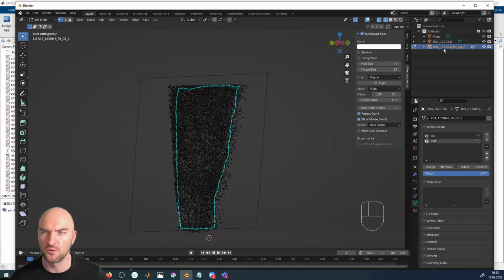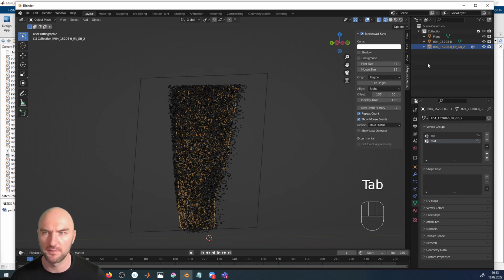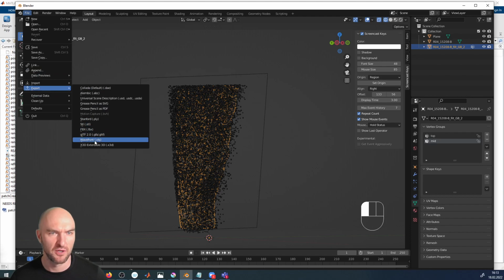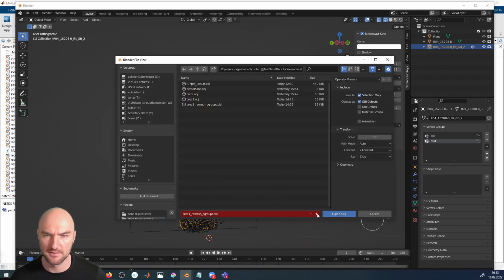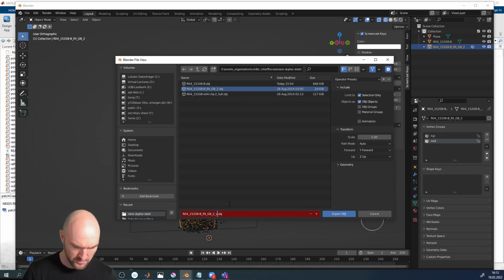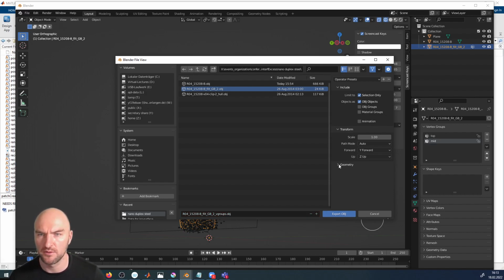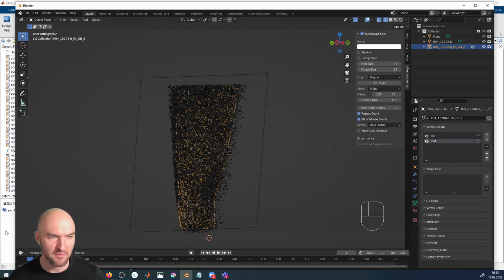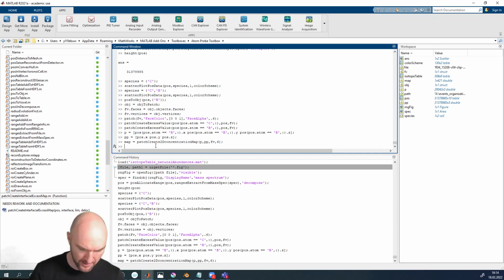And then I can go and export that again. So I'll just go out of the editor, go File, Export Wavefront OBJ, and now we'll call that something completely different: grain boundary 2, V groups. So we've got the vertex groups in there, and we'll just make sure that we have the poly group selected, export all of that, and pull that back into MATLAB.